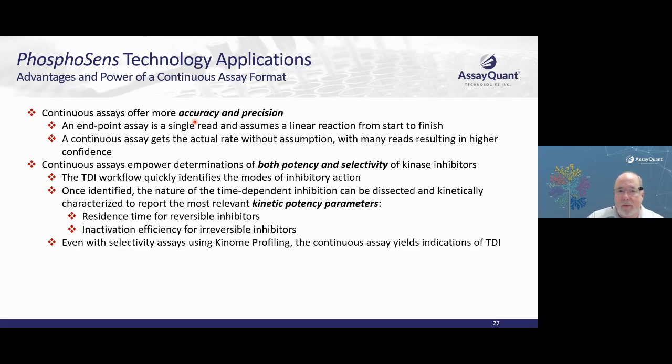And the TDI workflow that we described quickly identifies this novel mode of action, and then you can actually exploit that mode of action. There's a lot of interest in this lately, in this mode of inhibition that we do here. And then it allows you to report the kinetic potency parameters, which for reversible inhibitors are residence time or half-life, and for irreversibles is the inactivation efficiency.